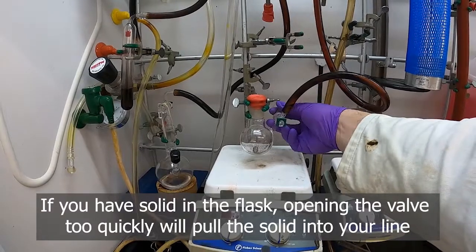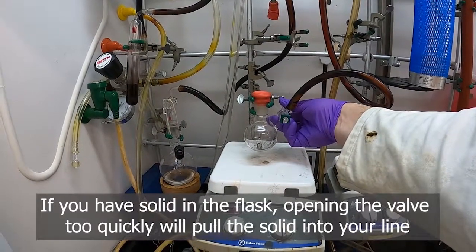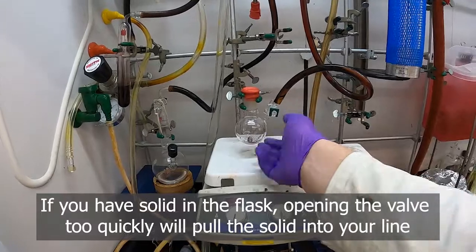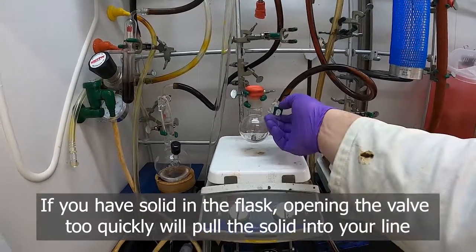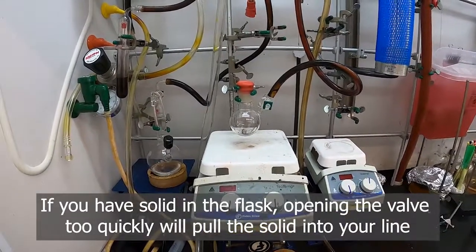We want to do that so that we have more control over the conditions there. And so that when we open the vacuum here, we don't just, we can sometimes pull some of the solid into the line. It doesn't happen that often, but it can happen.